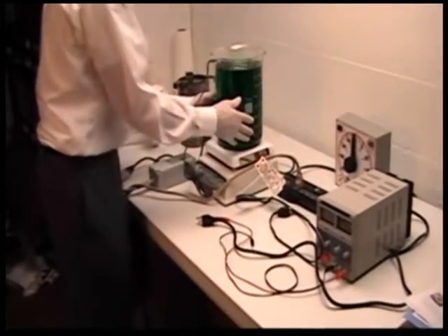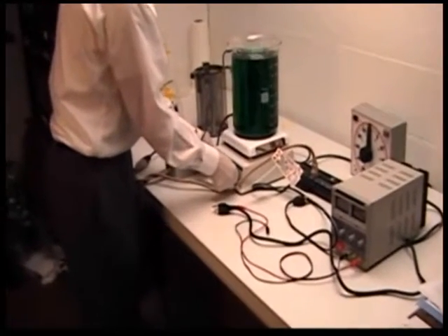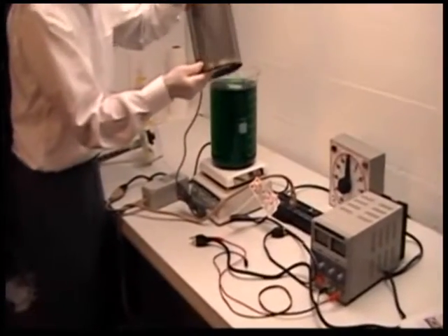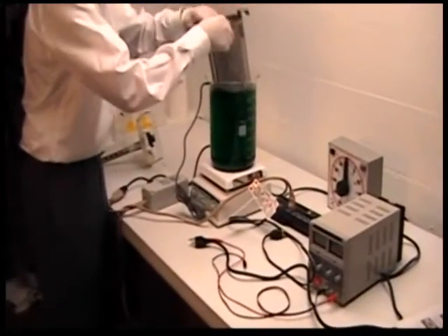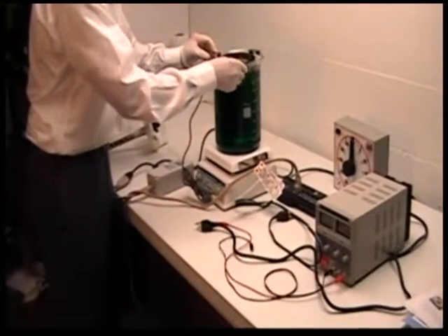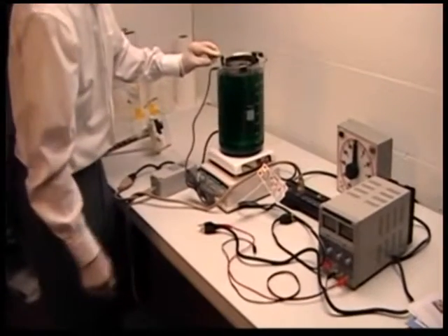The bath will be brought to temperature. The magnetic stirrer will be turned on. The anode basket — this one does not have the anode buttons in, but for the purpose of demonstration — the anode basket will be put in there in a central position. It's designed to be self-centered over the beaker.